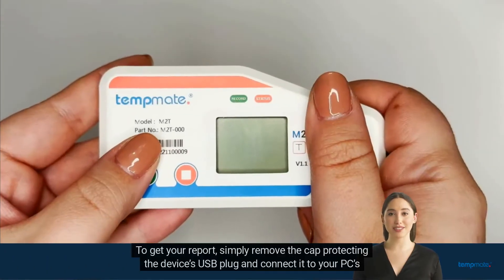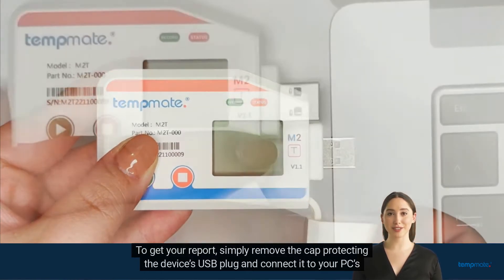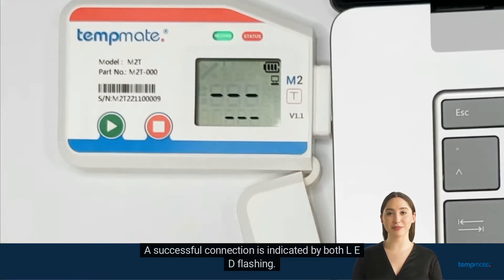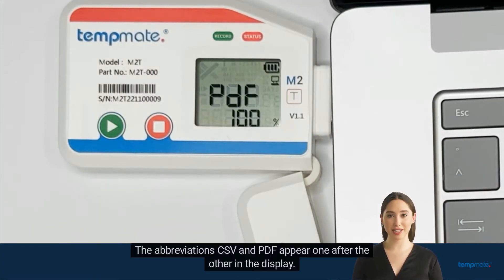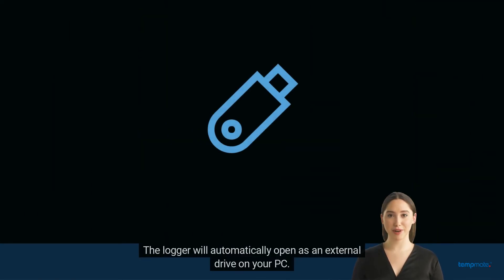To get your report, simply remove the cap protecting the device's USB plug and connect it to your PC's USB port. A successful connection is indicated by both LEDs flashing. The abbreviations CSV and PDF appear one after the other in the display. The logger will automatically open as an external drive on your PC. This process may take a few minutes depending on the amount of data.